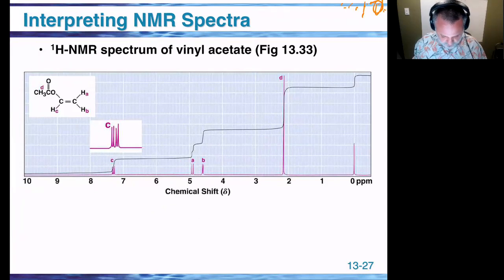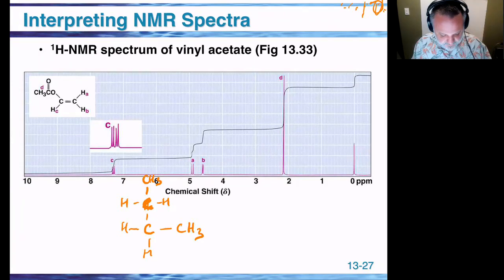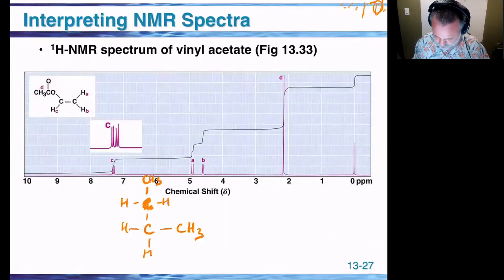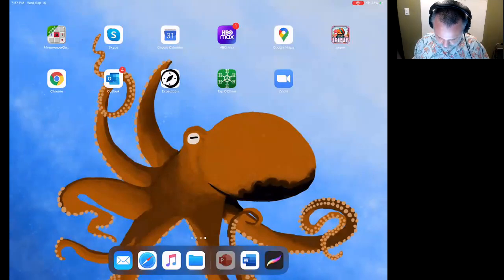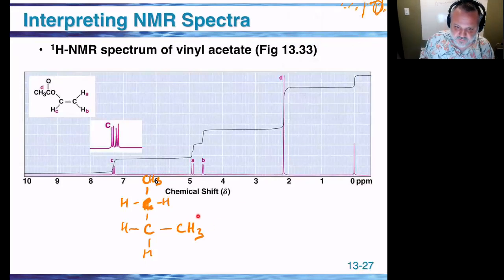Come out wherever you are. All right, I'm going to ignore it for now. What about this situation? Let's specifically look at this set.